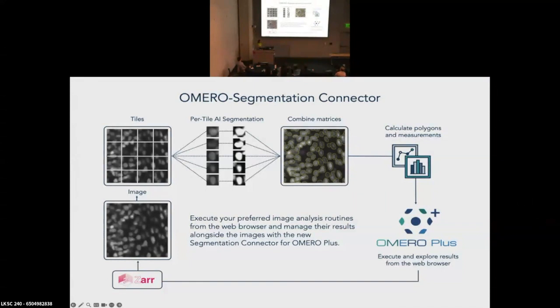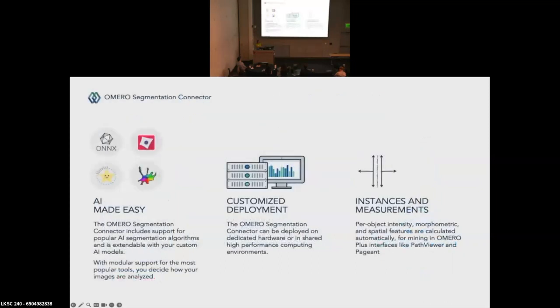So that's one of the technologies that we're using to make this tiling of the images a little bit easier, so that we can access subsets of the data at once, not only subsets in terms of spatial tiles, but also multi-resolution data. I'm not going to go into too much detail, but for those who are interested in that particular topic, happy to discuss it in more detail.